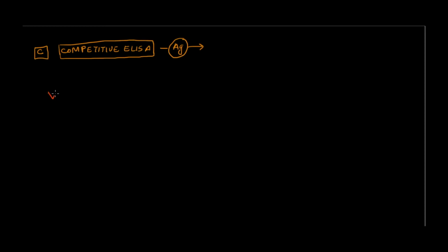I'm going to have particular antibodies against that antigen, and then I'm going to mix the sample with this antibody. Now this step is not done in the ELISA plate, okay? This is done before we add this mix to the ELISA plate. So this is outside the ELISA plate. And these antibodies are against whatever antigen that we are looking for.